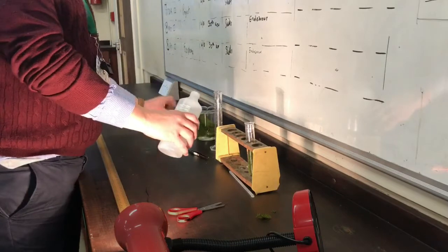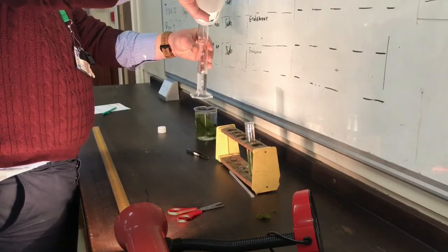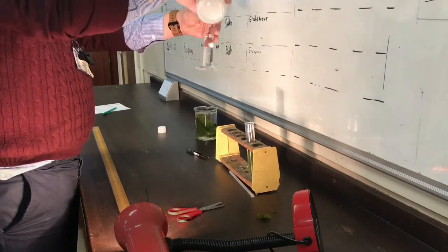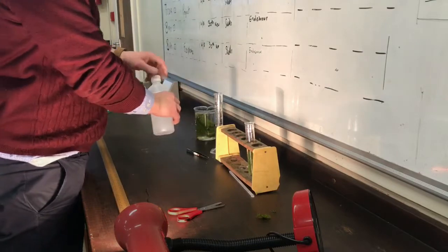And then I'm going to pour in our solution to use 30 milliliters of our solution to cover the plant.